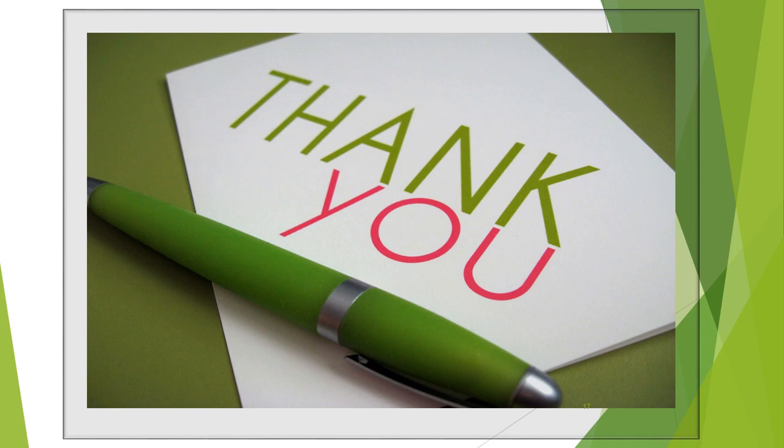Dear students, this was some basic information about scanning electron microscopy, and in our next lecture we will discuss how a scanning electron microscope works and what the main components used in scanning electron microscopy are.